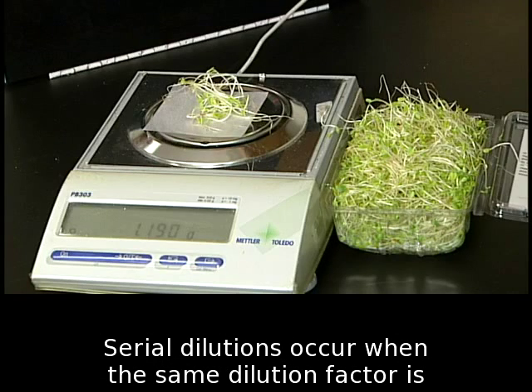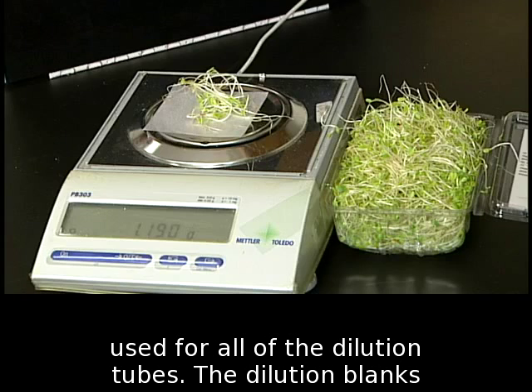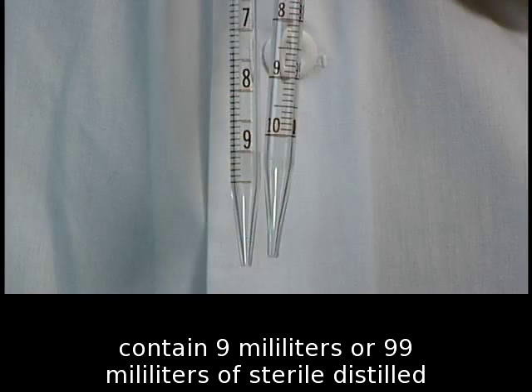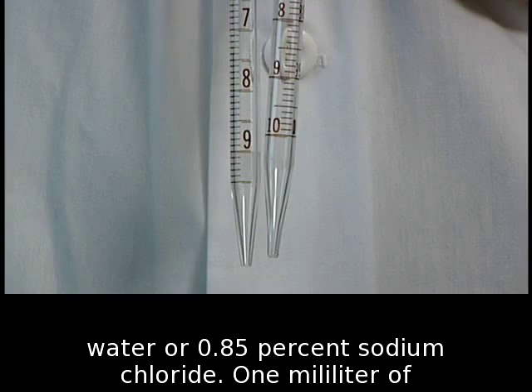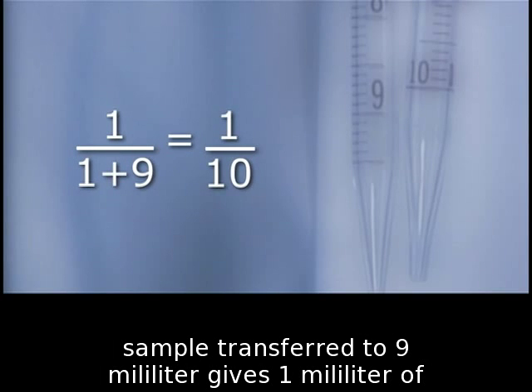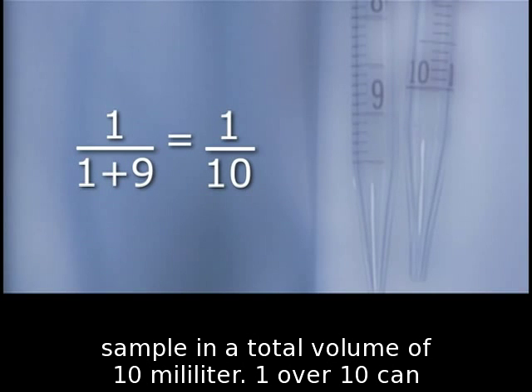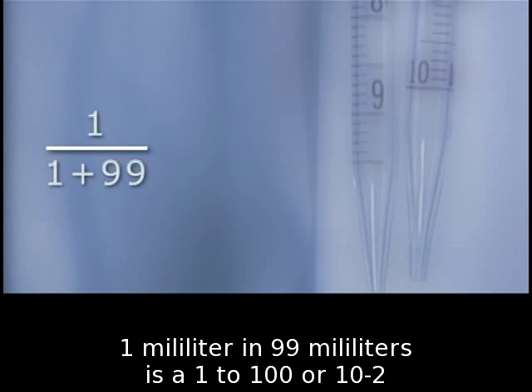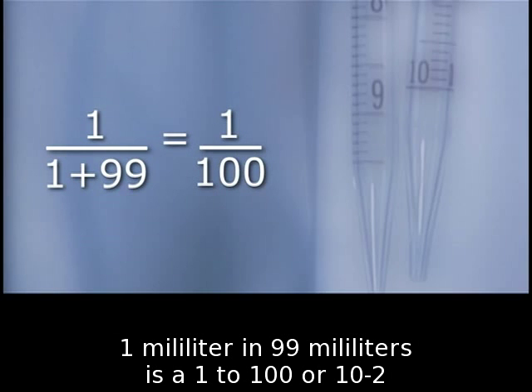Serial dilutions occur when the same dilution factor is used for all of the dilution tubes. The dilution blanks contain 9 milliliters or 99 milliliters of sterile distilled water, or 0.85% sodium chloride. 1 milliliter of sample transferred to 9 milliliters gives 1 milliliter of sample in a total volume of 10 milliliters. 1 over 10 can also be written as 0.1, which is equal to 10 to the negative 1. 1 milliliter in 99 milliliters is a 1 to 100 or 10 to the negative 2 dilution.